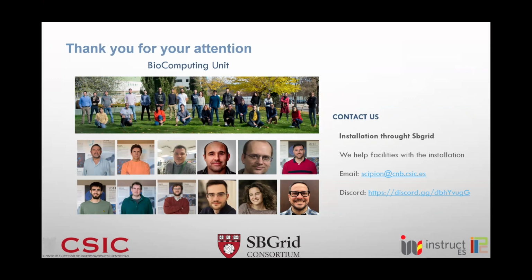If you are a facility and you are interested in trying this live image processing, you can contact us and we will help you with the queue system and all the settings that you need.